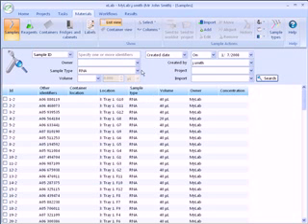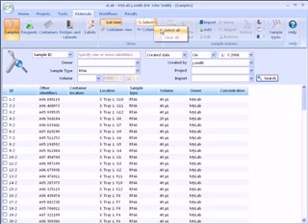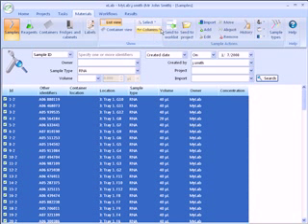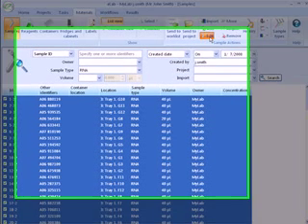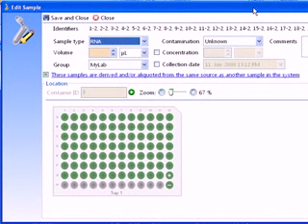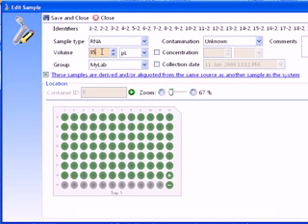To edit one or more samples, select them, then select the edit button. For example, here we are changing the volumes of all the samples to 35 microliters.